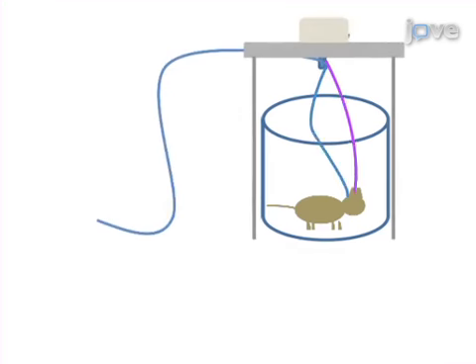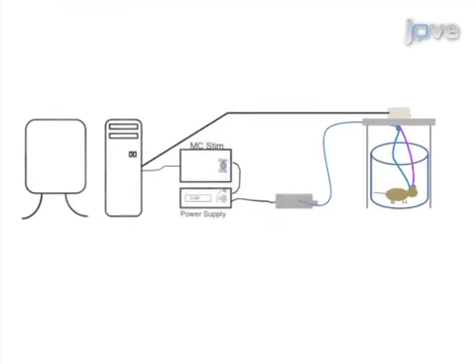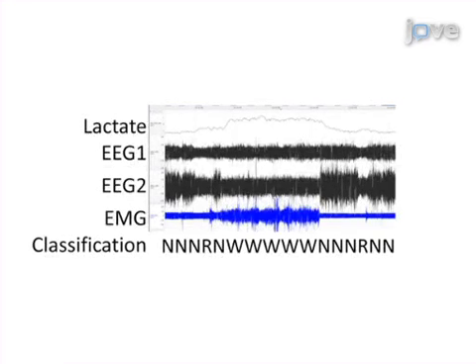Insert the fiber optic cable and pre-calibrated lactate sensor into their guide cannulas in the animal skull. Next, adjust the blue light stimulus intensity to achieve the desired electrophysiological response, then proceed to collect the electroencephalographic, electromyographic, and lactate concentration data.